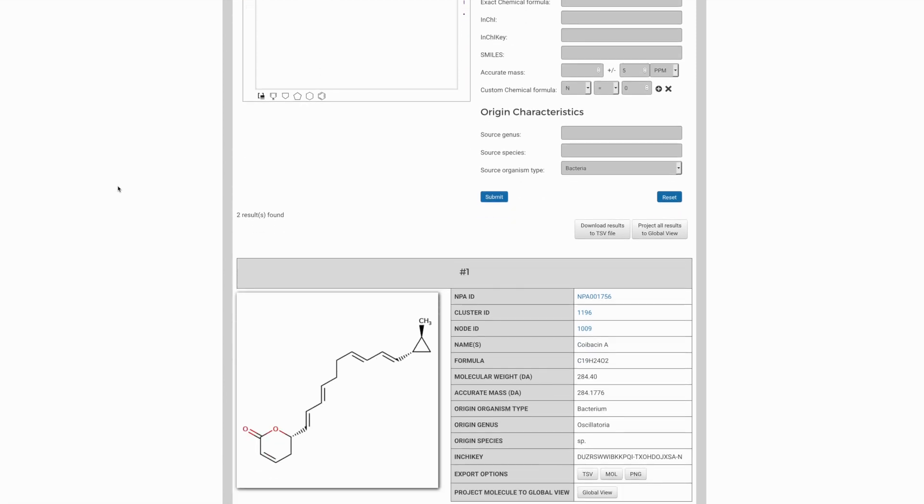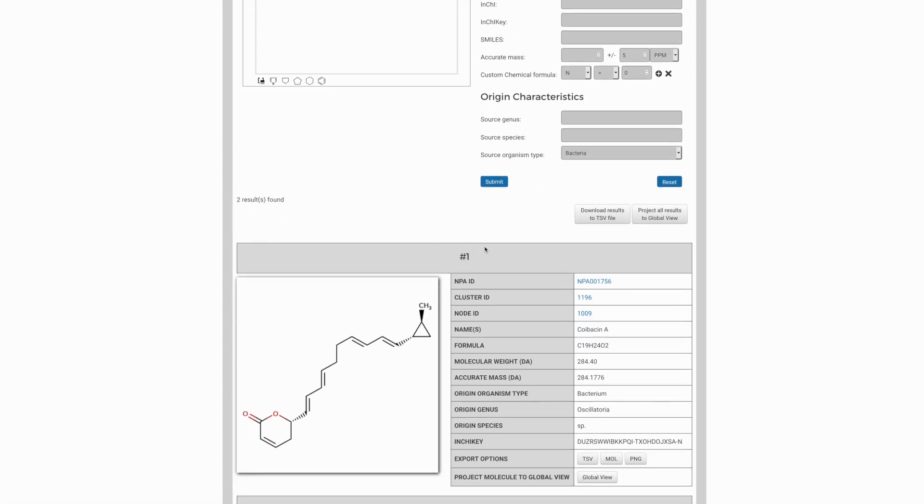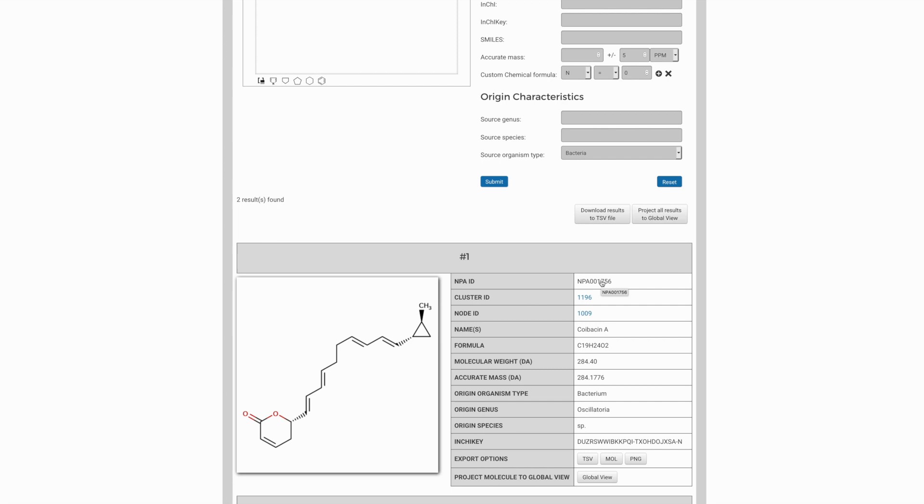And one would then go to the individual compound pages and from them to the original isolation papers to get comparative spectral data against which to compare the data from which you've made these assignments. So hopefully this gives you a view of how you might use the Atlas in different ways to compare against experimental data that you've acquired.